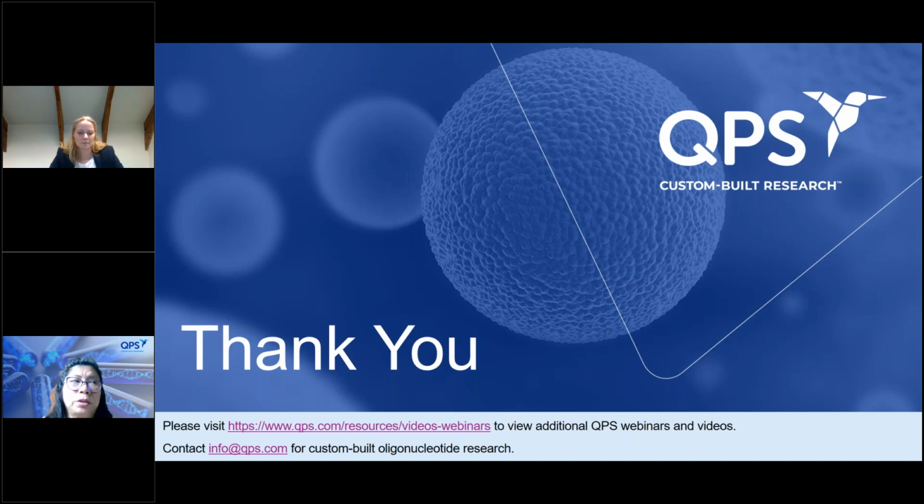So essentially you're ordering them twice. First a mini batch, and then once you select which ones you're going to use, you order a larger batch. Yeah, because you don't know upfront what is the right design of probes, and you first need to test that before you order a big bulk.